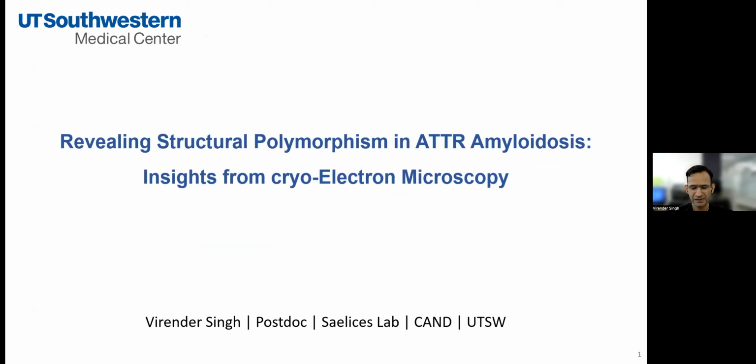The work our lab mostly focuses on is systemic amyloidosis, particularly transthyretin amyloidosis. And today I'll be presenting work which is related to revealing structural polymorphism in ATTR amyloidosis with insights from cryo-electron microscopy.